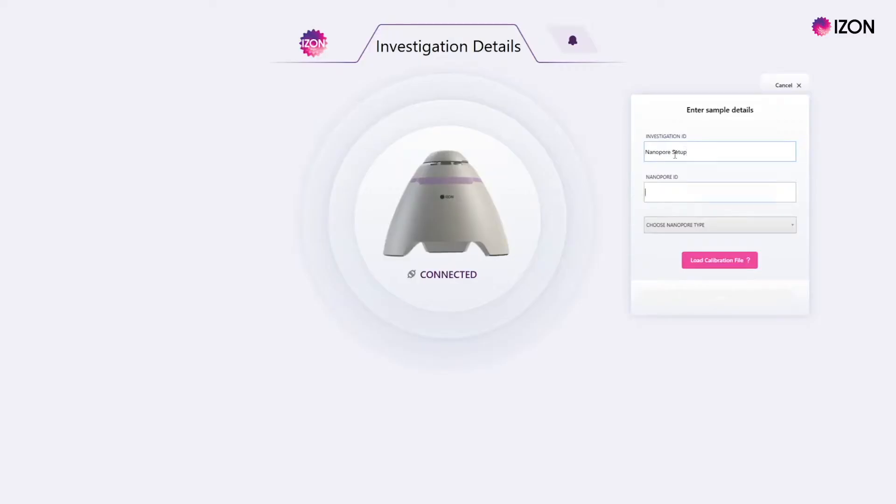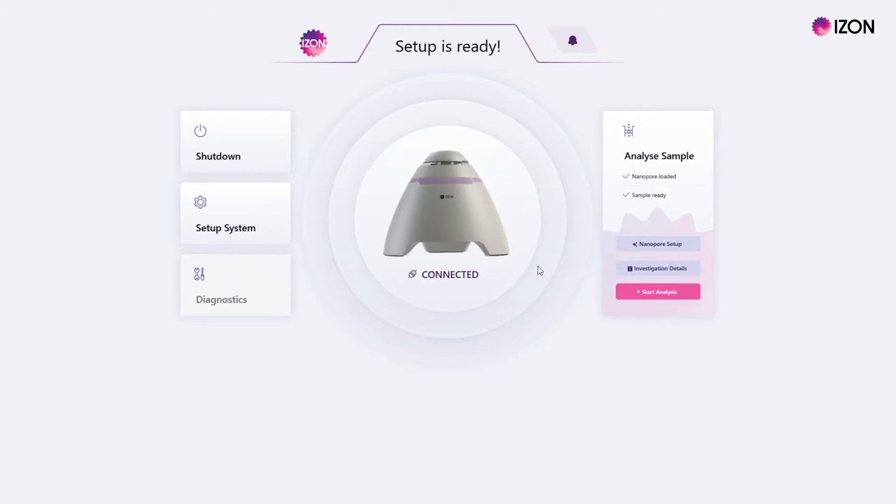Click on the investigation details button and fill in the investigation ID, nanopore ID, and NP number. The nanopore setup button should now be available — click on it and follow the prompts to load your nanopore.